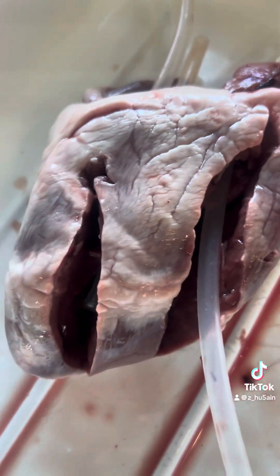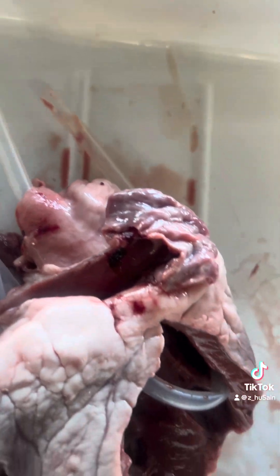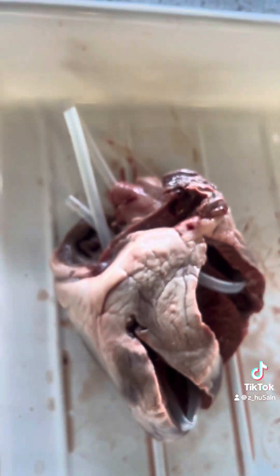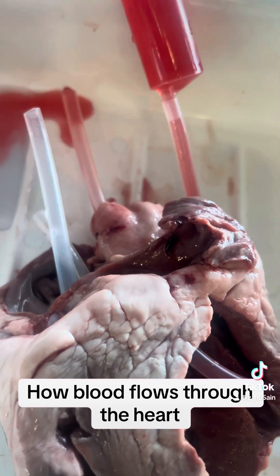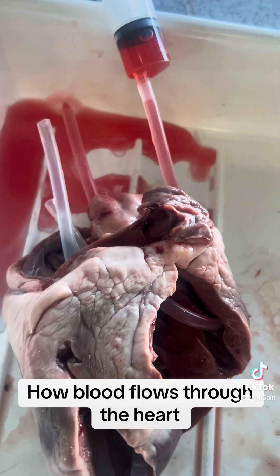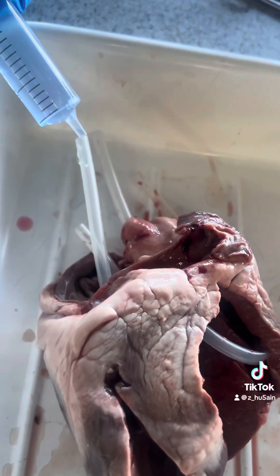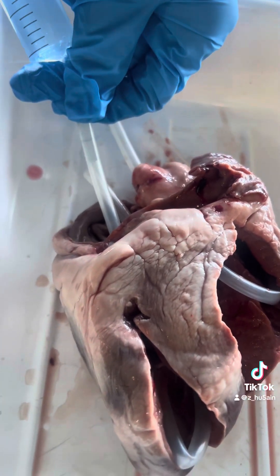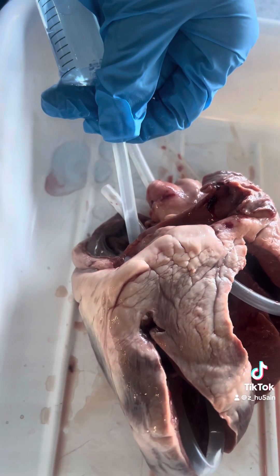Wow, look at that! Alright, awesome. There you are — perfect. You've got the blood flow. Yeah? Happy with that? Easy? Makes sense? Well done. Perfect. That's the blood flow.